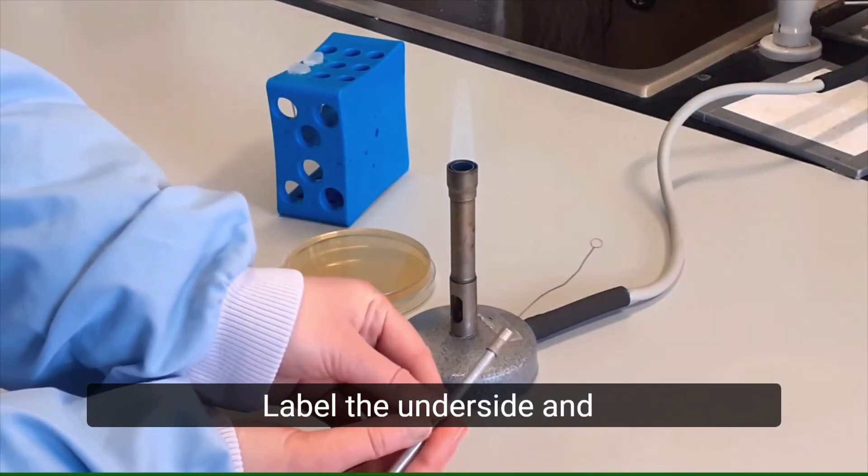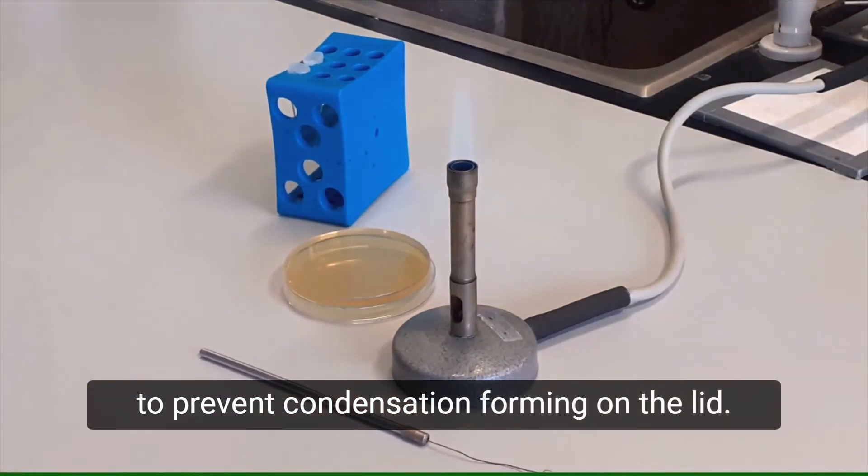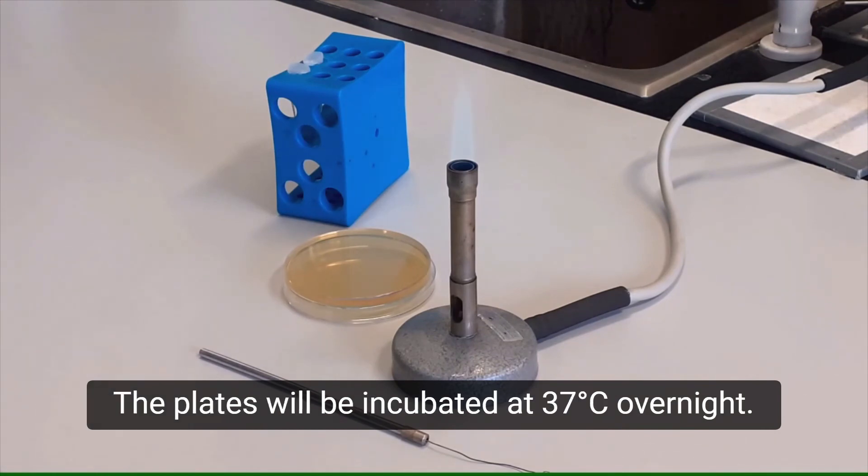Label the underside and keep the plate upside down to prevent condensation forming on the lid. The plates will be incubated at 37 degrees overnight.